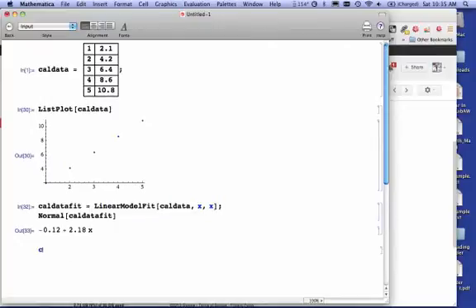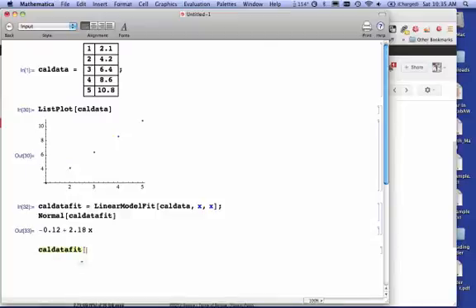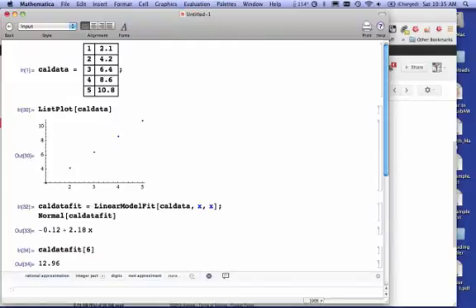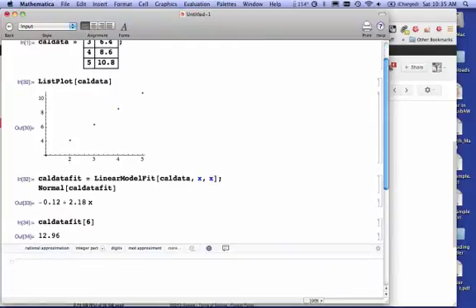Well, let's find out for sure. So let's use our CalDataFit, and let's see what the value of Y is if X is 6. So I'm going to evaluate that, and I get something around 12, actually pretty close to 13. So that's what my data looks like.